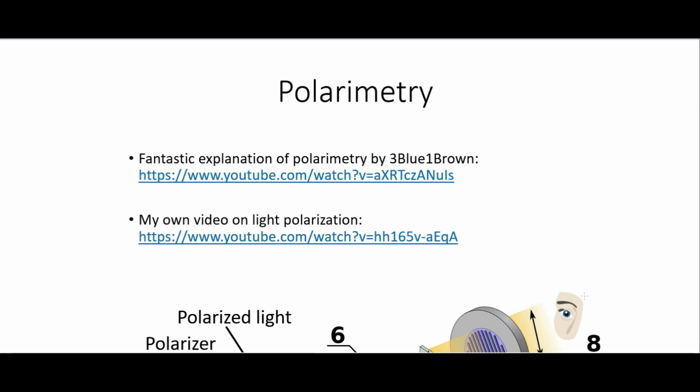And as we'll see, mostly it'll be 50-50, but you can measure if you have an excess of one or the other. And so in polarimetry, and I'm only going to cover this at the level that you would see it in a 200 level organic chemistry class.